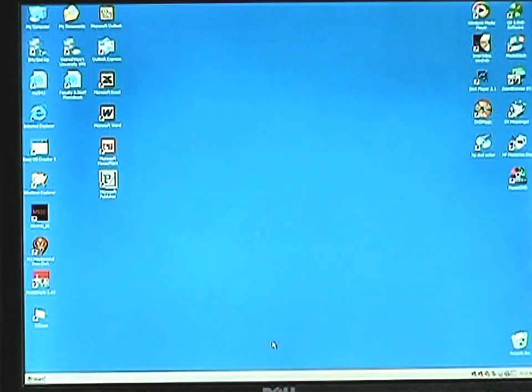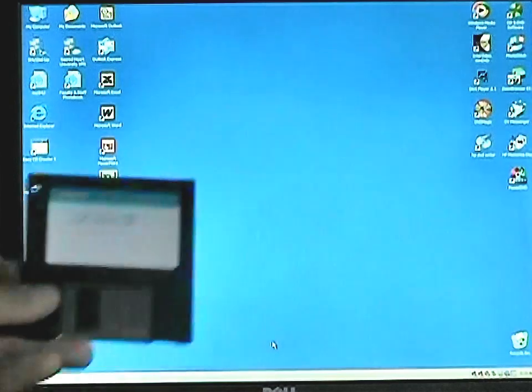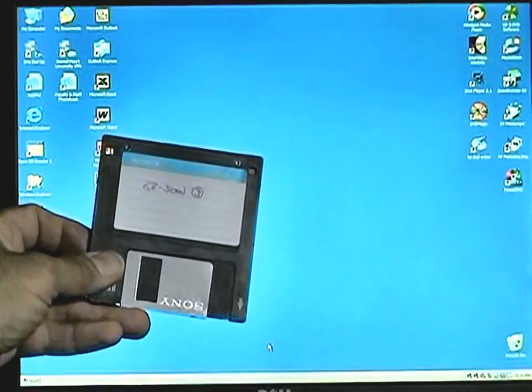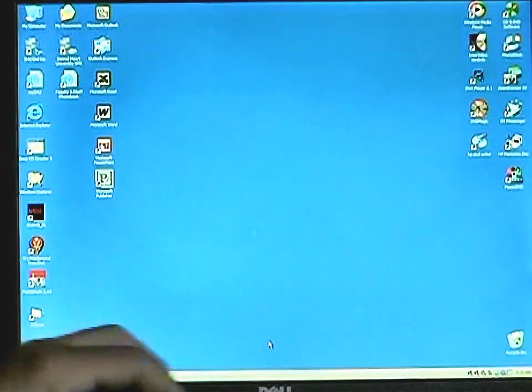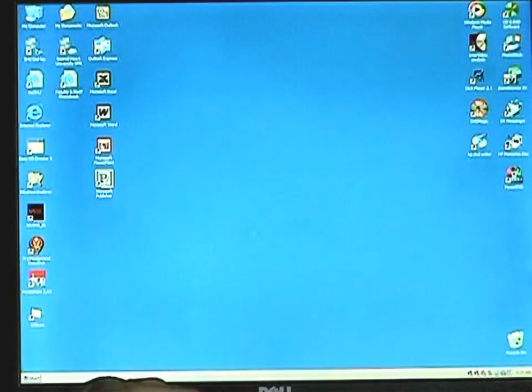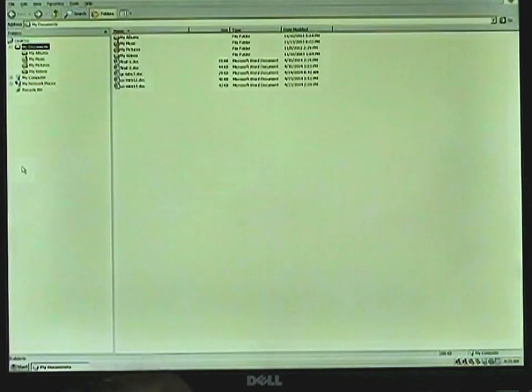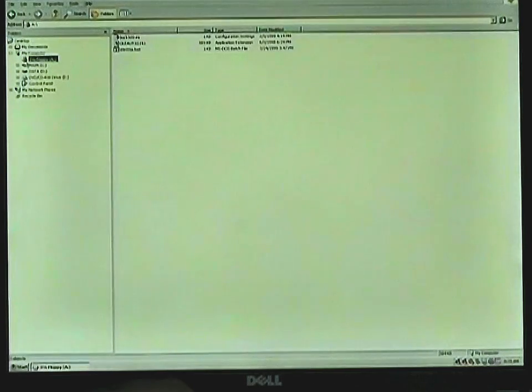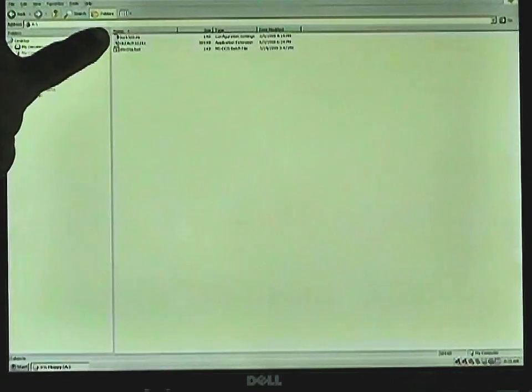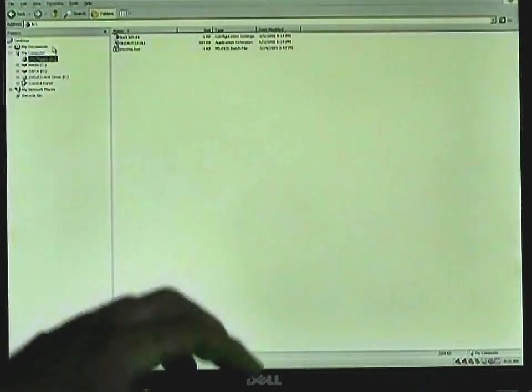Now there may be a disk 3 included with your software package, again depending upon the version of Windows you have. Insert this into the drive, and using Windows Explorer, copy the Buck 500 INI file.